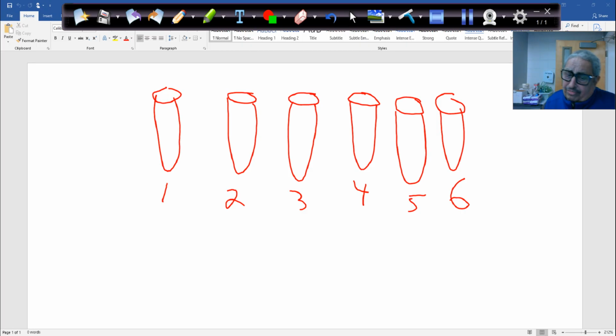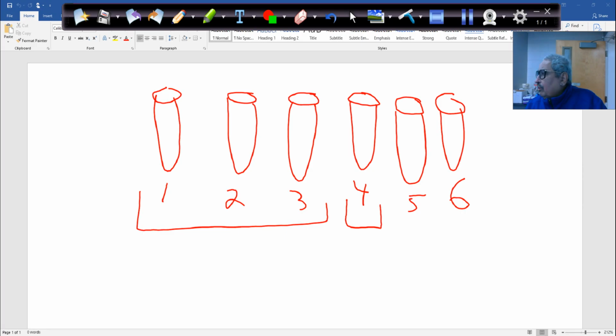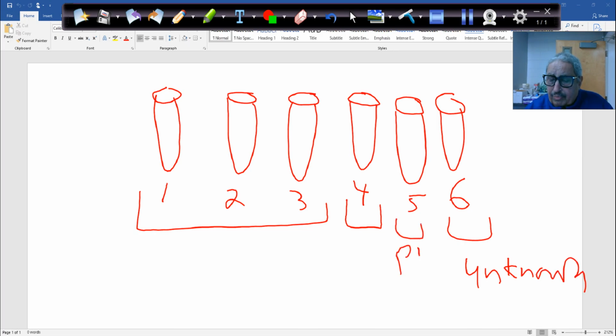So we'll have 3 of those here. Alcohol. This is phenol, correct? Those are alcohols, this is phenol. This is your unknown. This is your phenol. And this belongs to alcohol. We'll take 4 of them. So 4 of those alcohols.